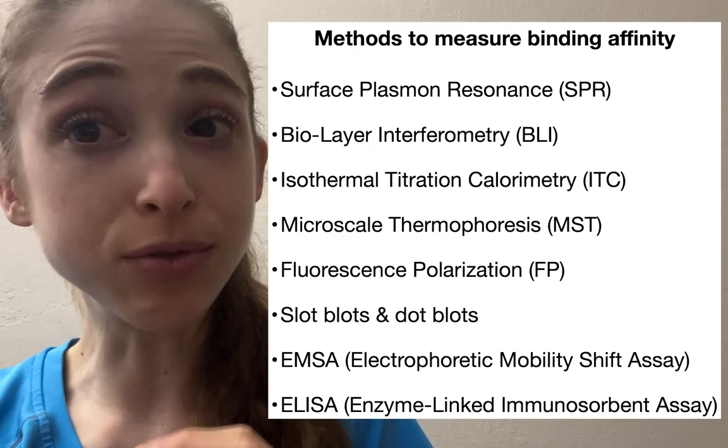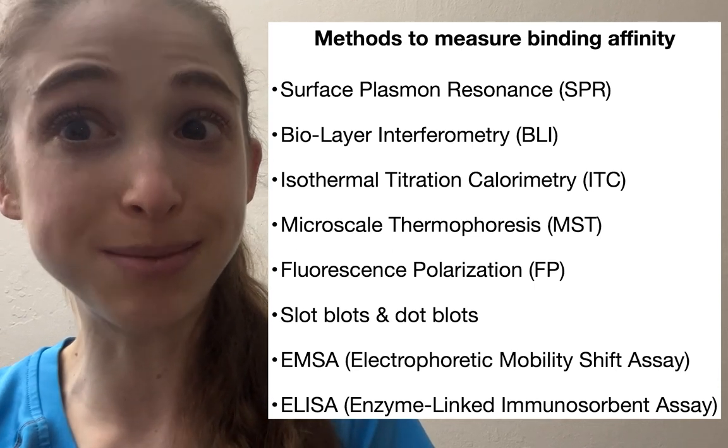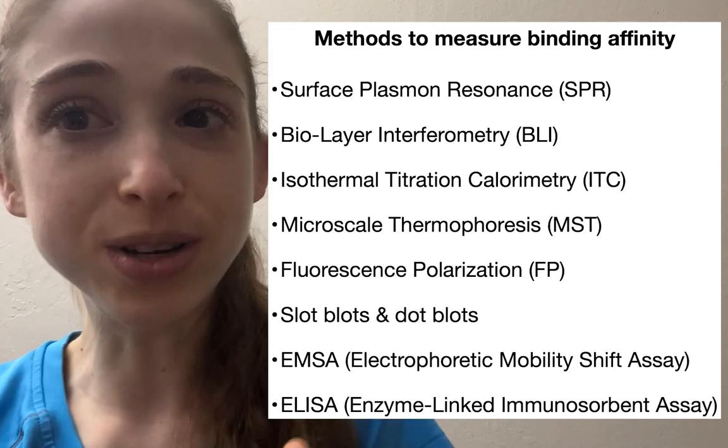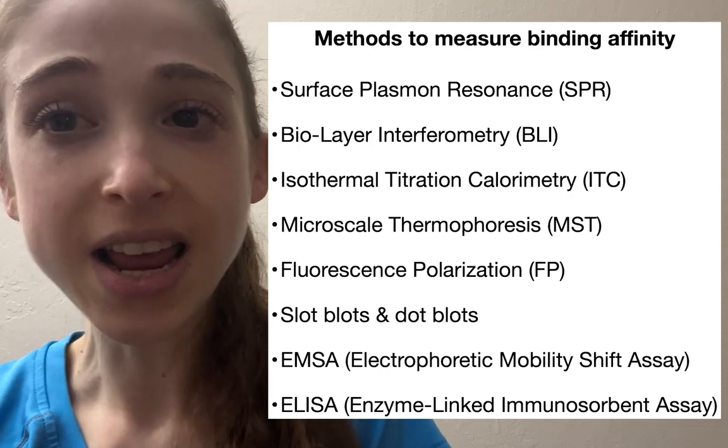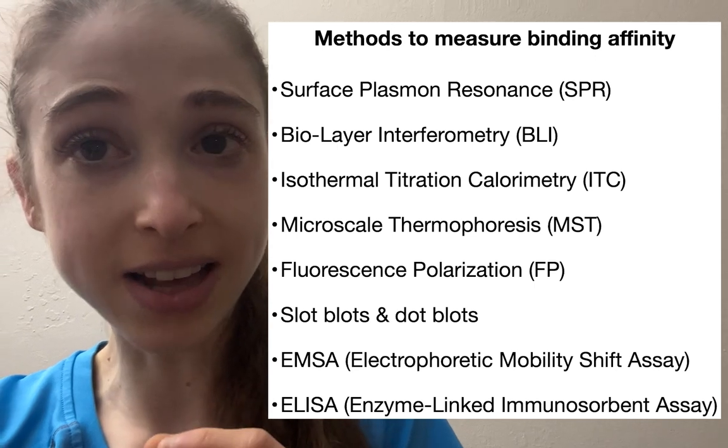Measuring this KD is really important because, well, just because two molecules can bind one another doesn't mean that they actually will. This is all going to depend on their concentrations and their affinity for one another. So let's talk about how we can measure that.